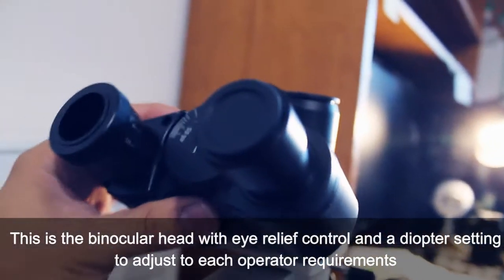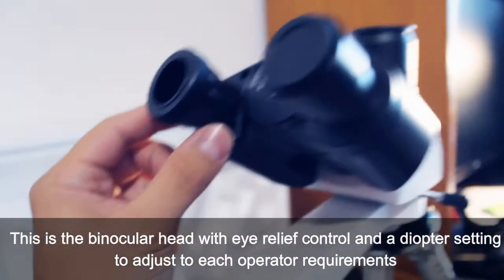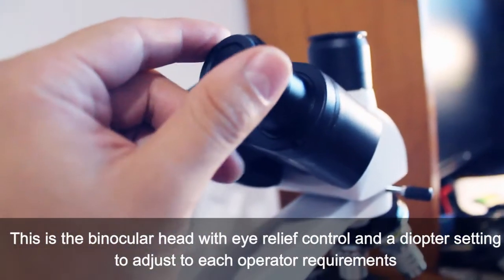This is the binocular head, with eye relief control and diopter setting to adjust to each operator's requirements.